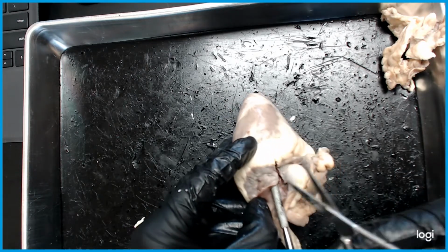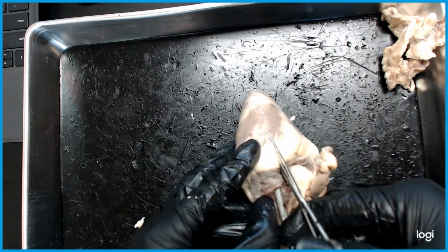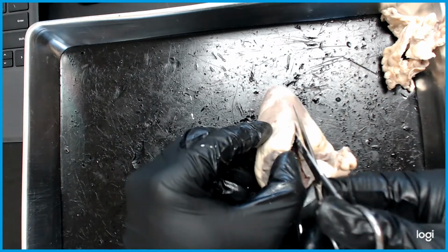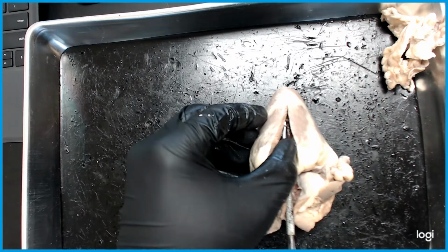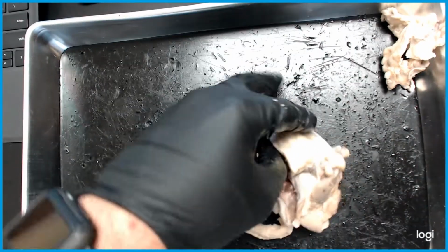At the tip, you should be able to feel the probe. As you're going through, I still feel the probe. I continue going. As I start opening up, I see it. It continues. Keep going down until I reach the tip of the probe. This allows me to open up the heart in a butterfly format. So now let's go ahead and look at it.